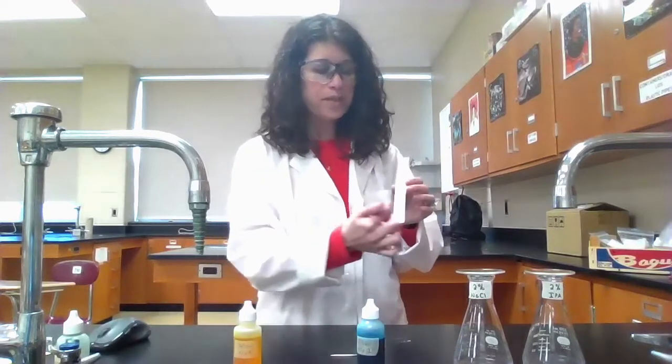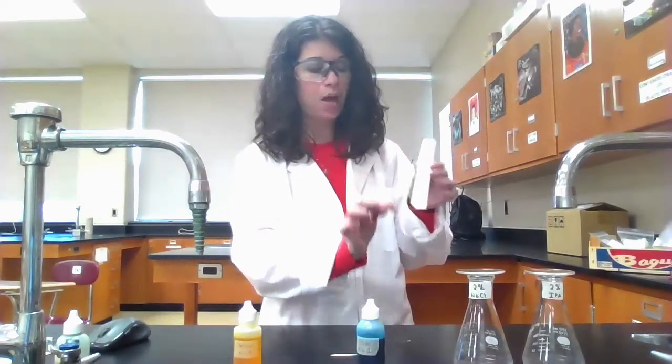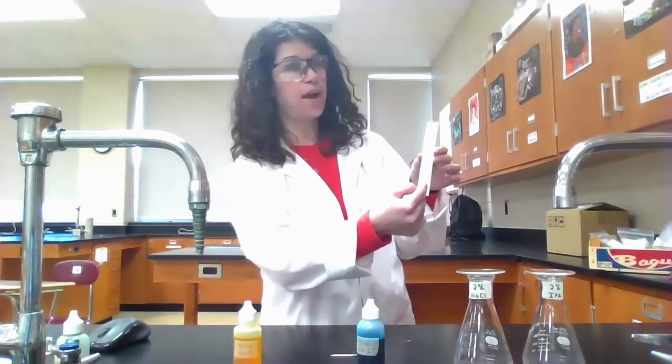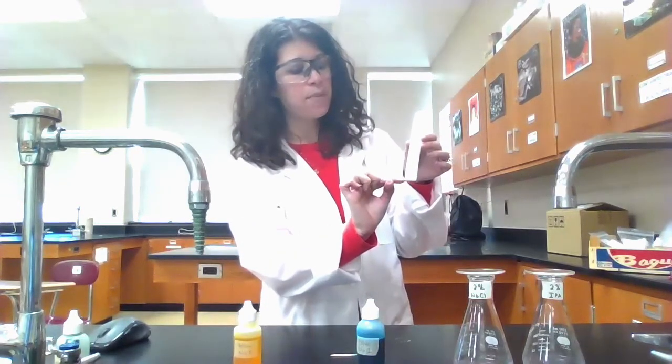To test the known dyes, we're going to dip a toothpick into the dye and spot it on the paper. There are a couple of things to consider: when spotting, we don't want to start at the very bottom of the paper, because that part will get submerged in the solvent. We don't want the dye to travel down into the solvent — we want the solvent to travel up and take the dye with it, so we spot it a little bit higher.